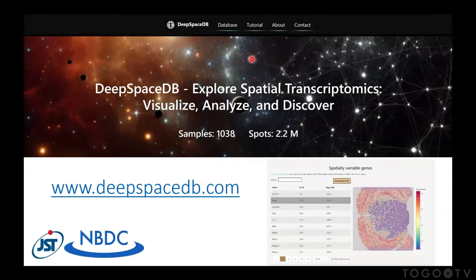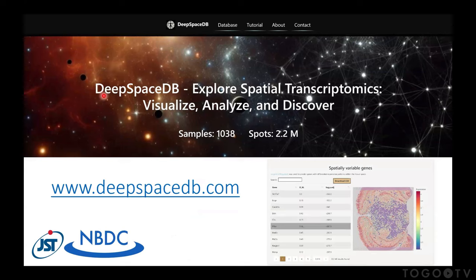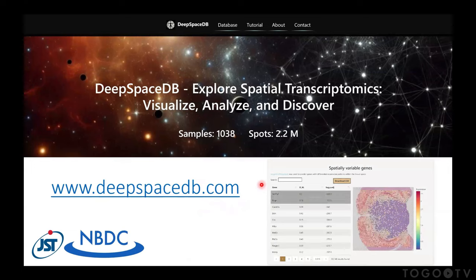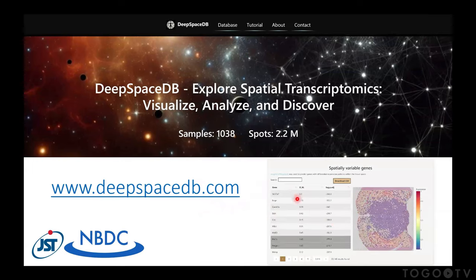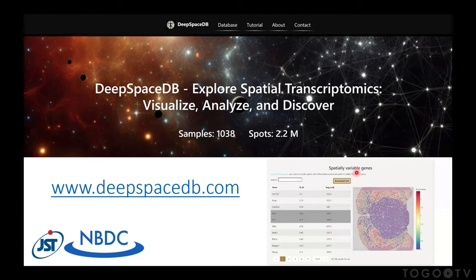And also I should say, I'm now developing a spatial transcriptomics database called DeepSpaceDB. This is the URL. And so a part of it is looking at those spatially variable genes. So we are using that single cell haystack to pre-calculate those results. And if you go to that website, here I'm running through some of them. So you can see in the mouse brain, for example, some of the high scoring genes, and they are clearly expressed in different parts of the brain. That's all. Thank you very much.